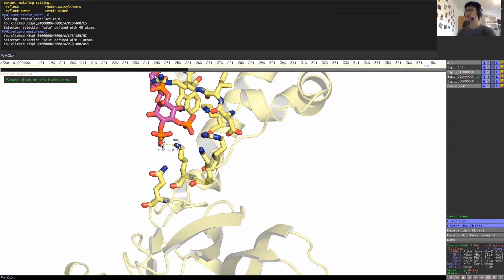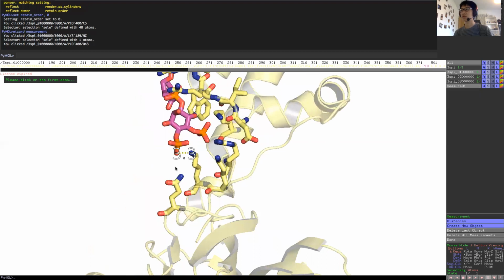What we can also do is measure the bond angle. So if you're interested in this, let's say the OCN bond angle, you can change from distance to angle, and you can measure the angle here between 3 points, and you can see that it's a pretty flat trigonal planar structure, which is 122 degrees in this built structure.